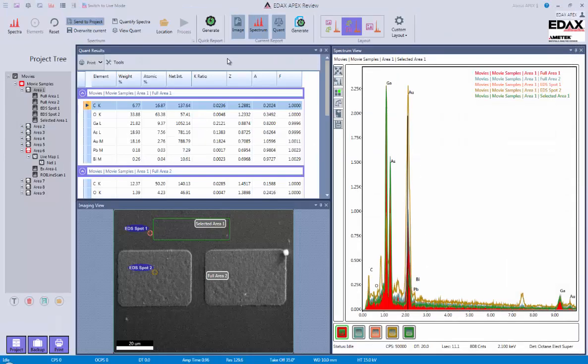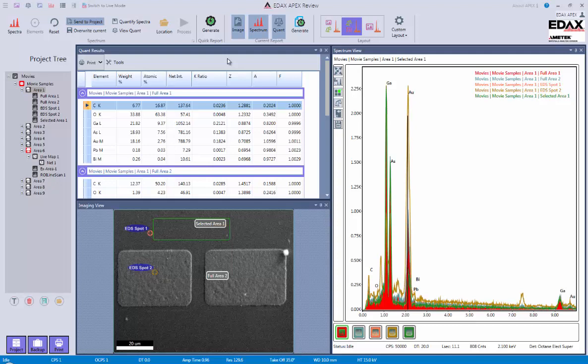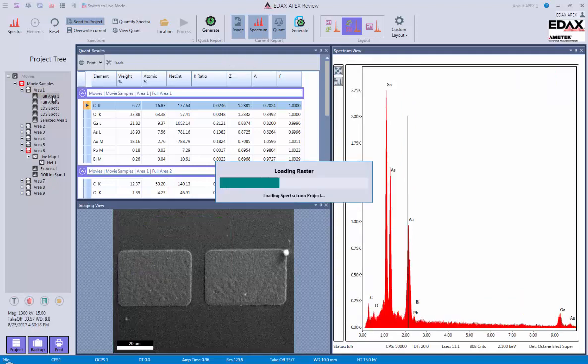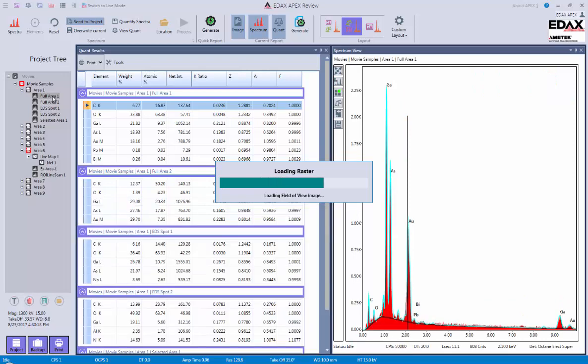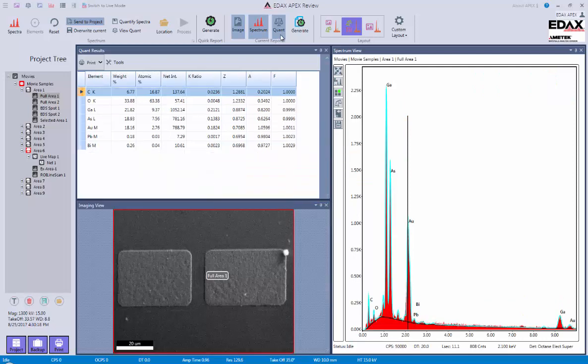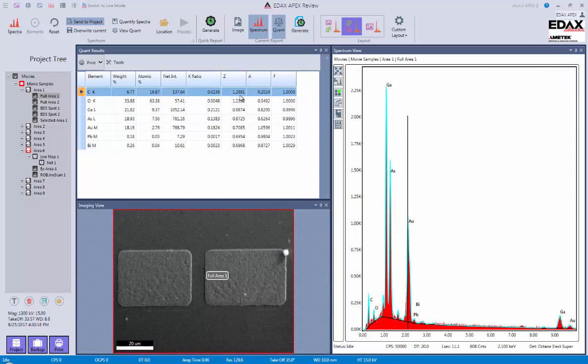Now what I can also do is kind of semi-customize these in different ways. So let's just open up one single spectra in this case. And let's say for some reason I didn't want the image. I can go ahead and turn the image off, and then click on generate. And this would generate a report without the image.